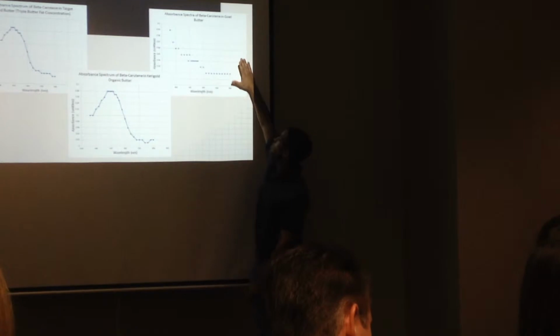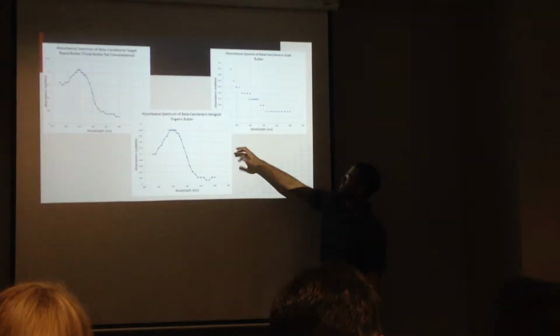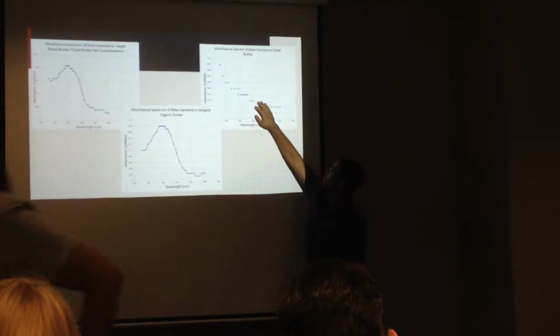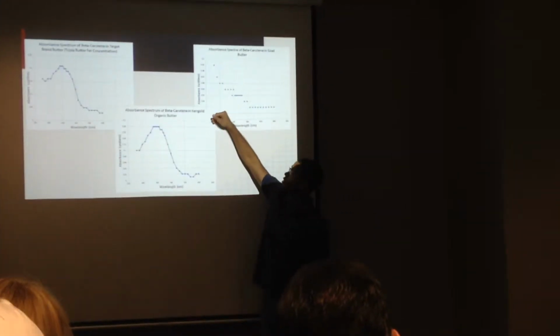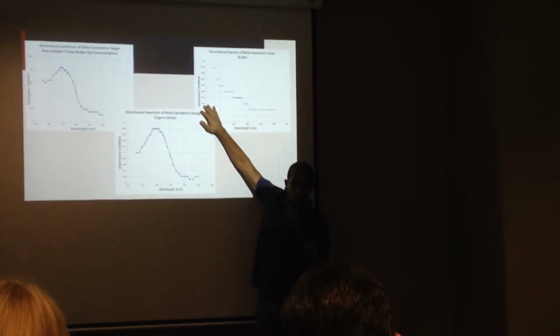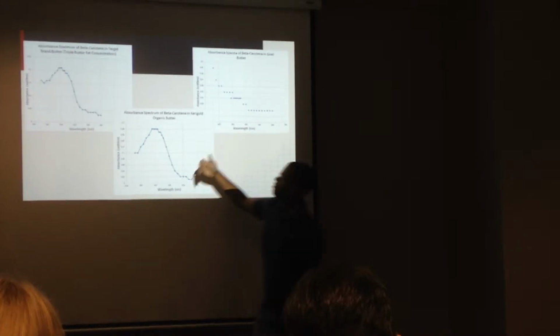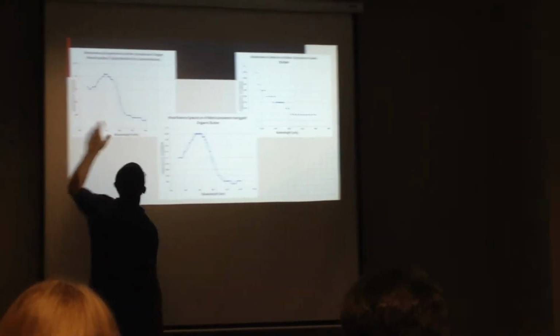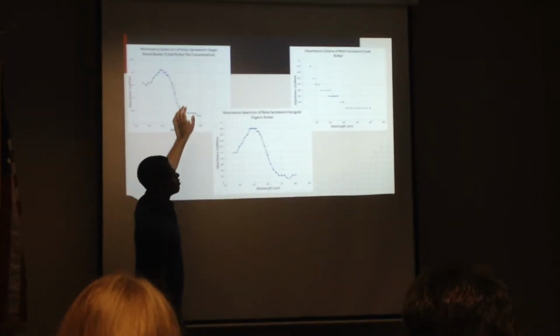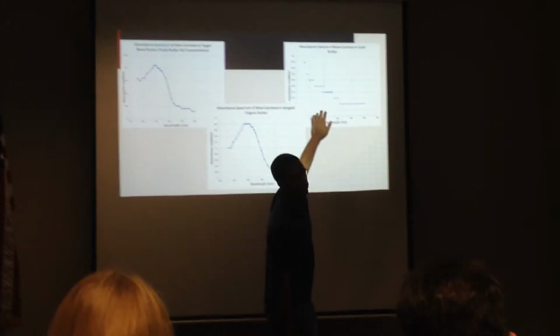So here, for contrast, is the goat butter. Not only does the curve look quite unlike the other two, but also it has very low absorbance. That's where you have to use dots instead of the line here. That's the low precision. So from this we can infer that beta carotene is what's doing the absorbance in the generic and the grass-fed butter, but not the goat butter.